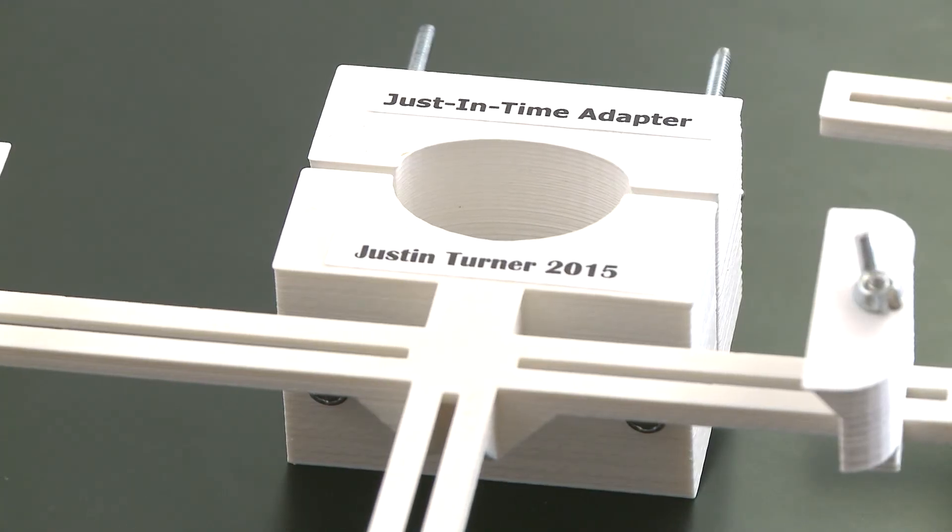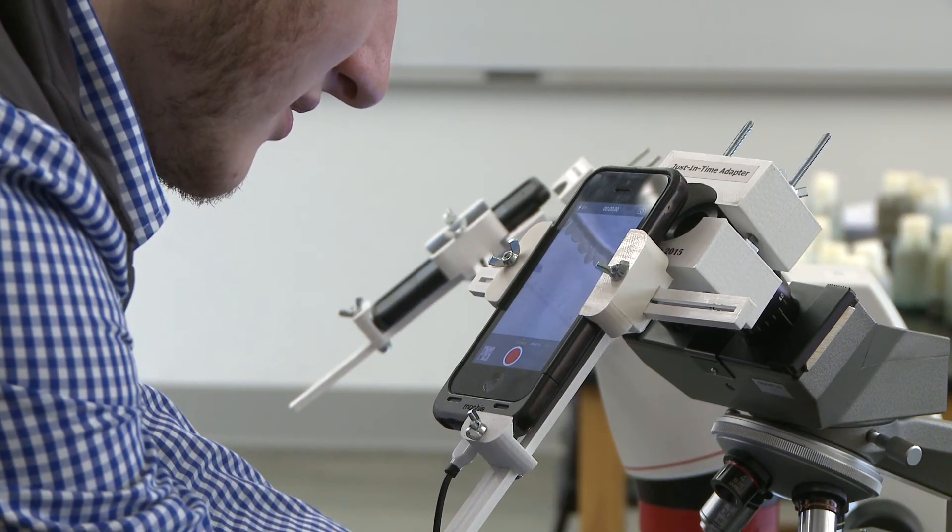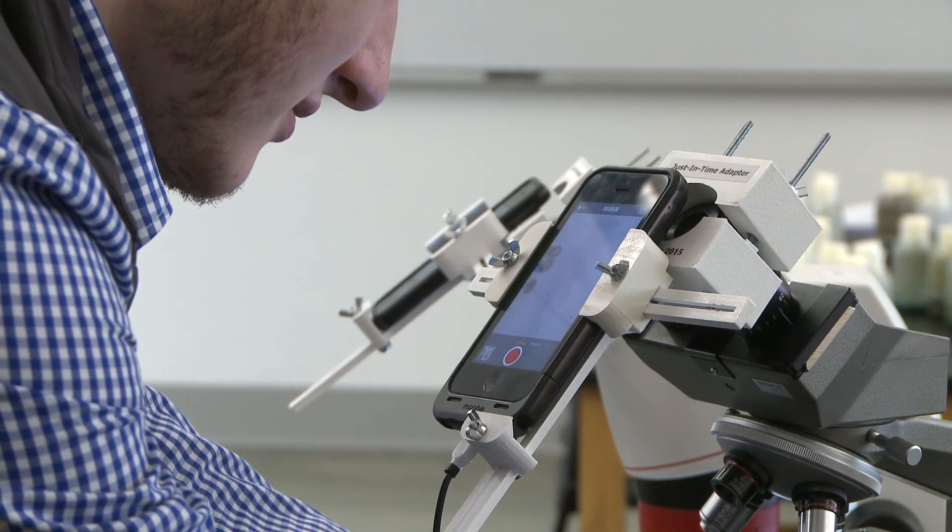Justin doesn't plan on patenting his adapter. He says he's too busy with school trying to get into KCU med school, and that patenting an adapter like this can cost thousands of dollars. Jeremy Lyons, Fox 26 KNPN.